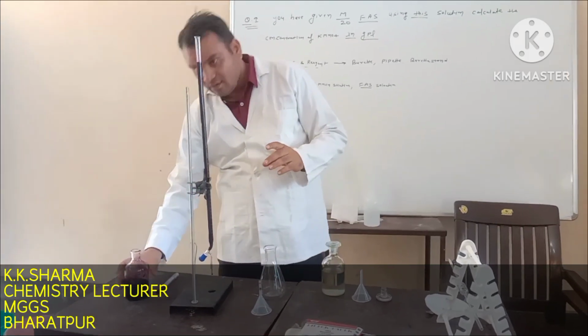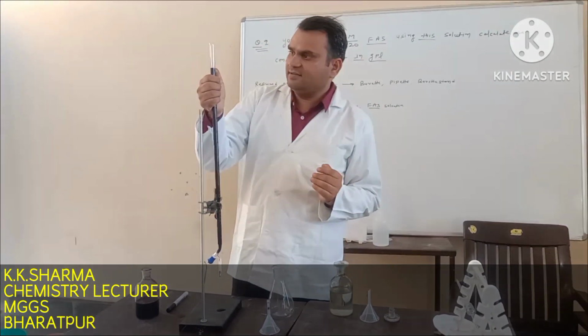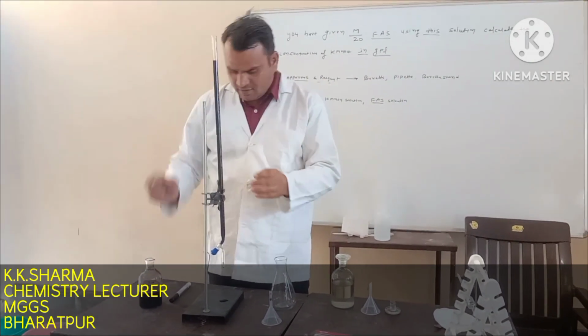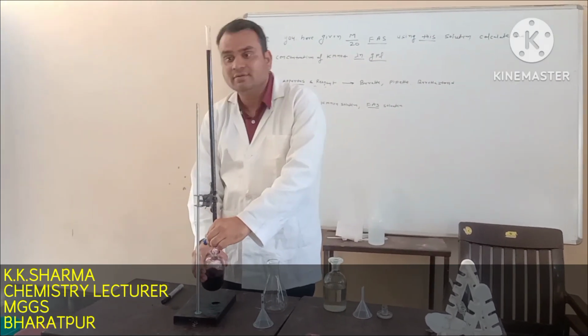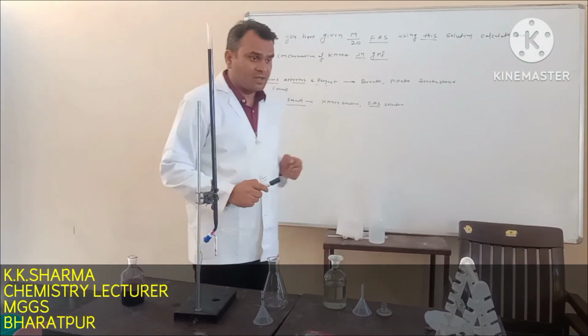When I fill the burette, we observe that the mark goes above the 0. Then the excess solution in the burette is removed by the stopper.